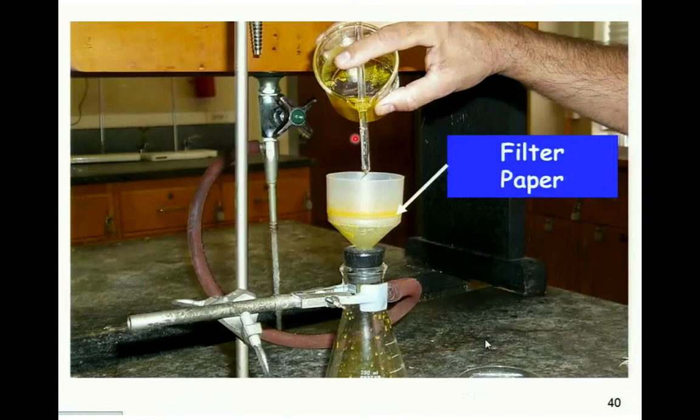All right, pouring it in there is going to be a similar thing. You want to pour as carefully as possible. Here in this demo, pouring down a glass stir rod to carefully pour it in there.